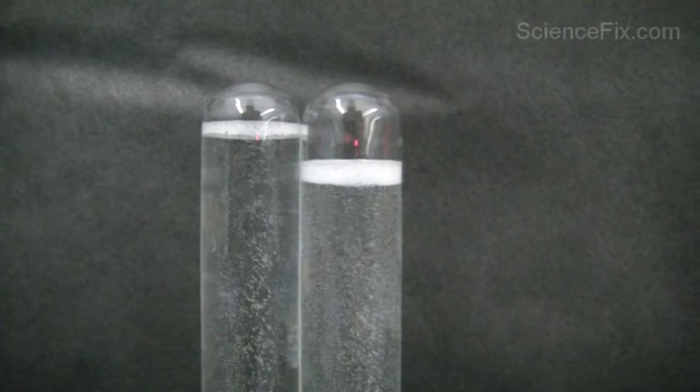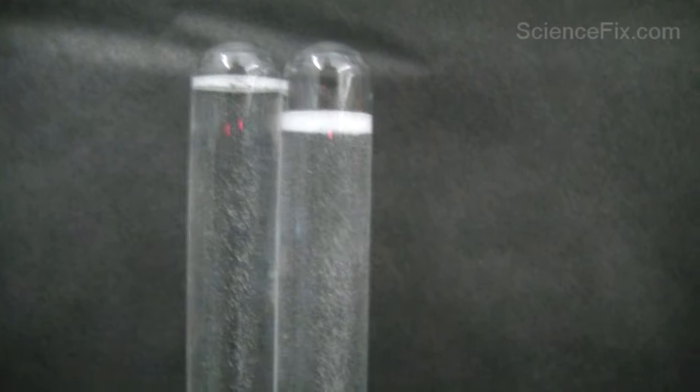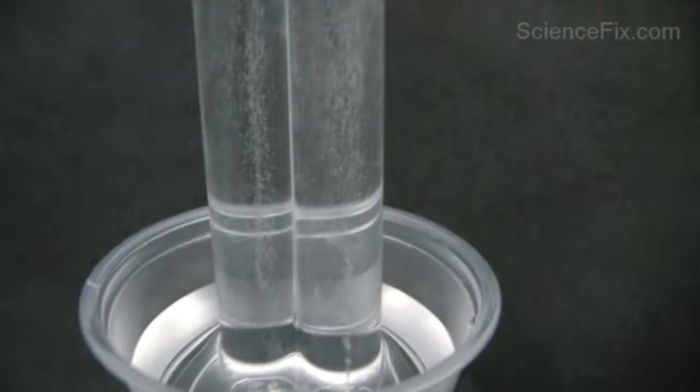This is how experimenters first learned that the ratio of hydrogen atoms to oxygen atoms in water is two to one, thus H2O.